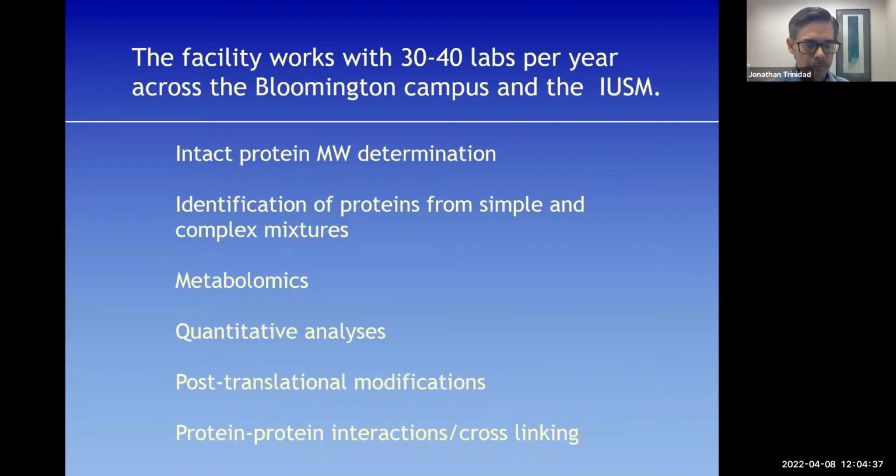Mass spectrometry, of course, is a really broad field, and the types of things that we do as a collaborative research service core are also quite broad. Some of it, in a way, is very, I wouldn't say trivial, but as the field progresses, certain basic things that we can do become commoditized, in the sense that there are fairly standard assays that you can get anywhere.